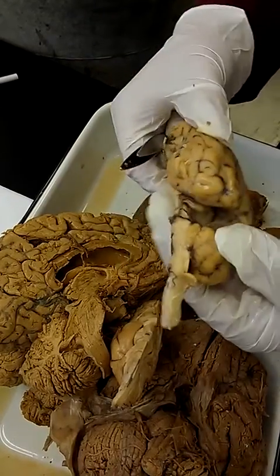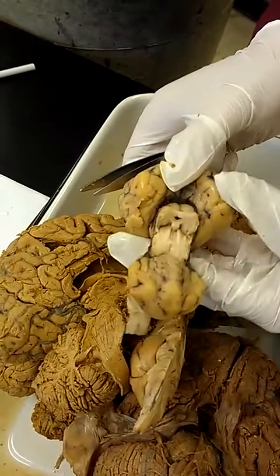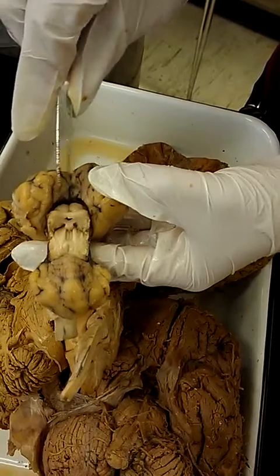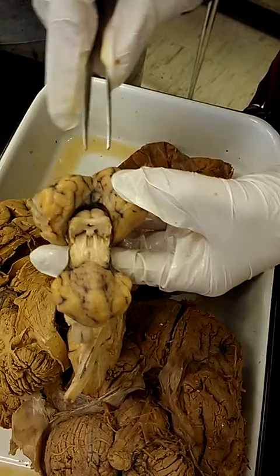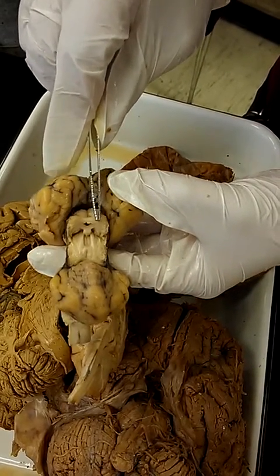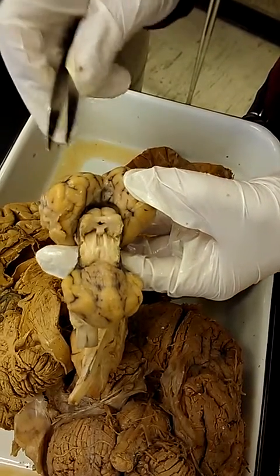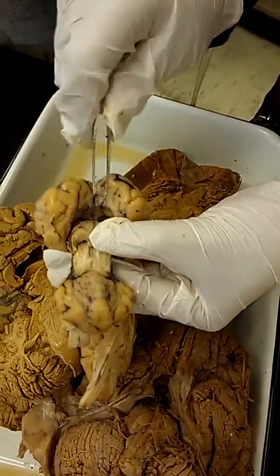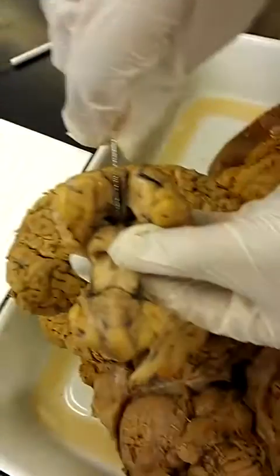And the corpora quadrigemina is right here when you pull down the cerebrum. Here it is right here. One, two, three, four. We have the superior ones at the top, the ones that look like a butt. The superior colliculi. And then below it, running transverse, are the inferior colliculi. And then when we pull the whole thing down, you see that little thing right in there? That's the pineal gland.